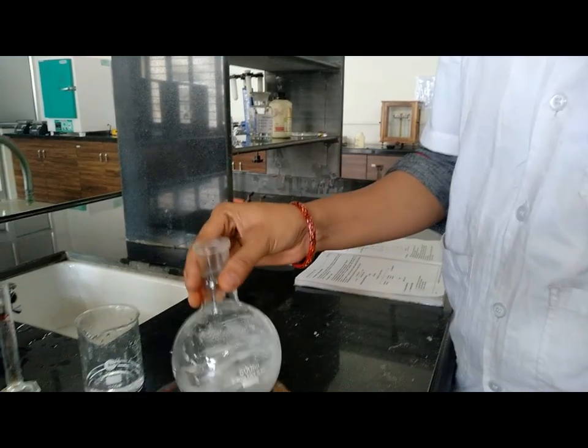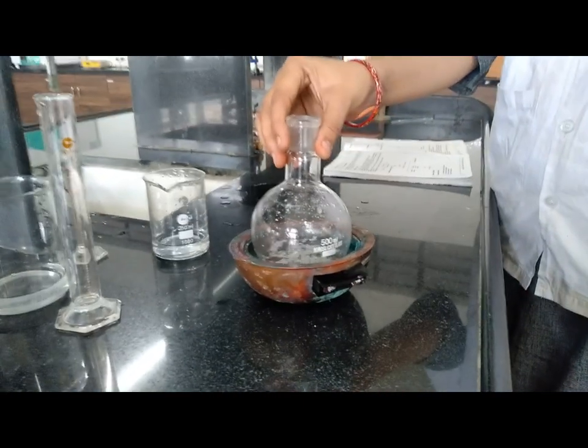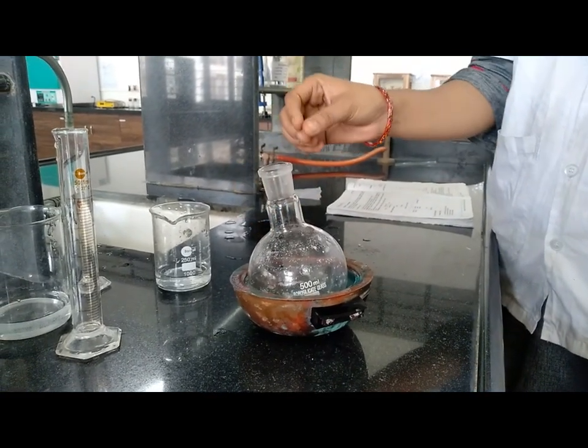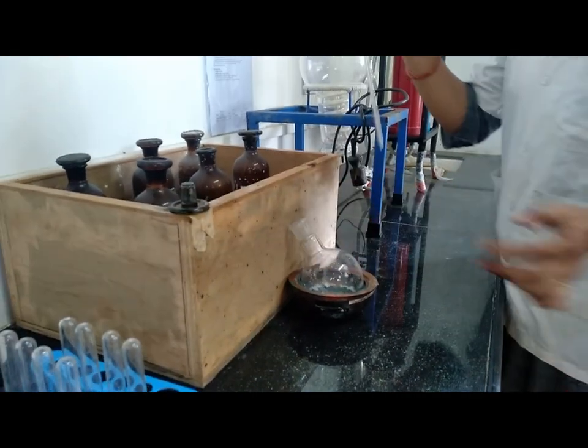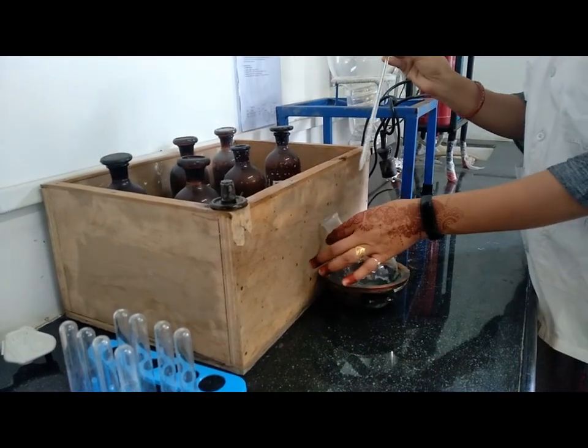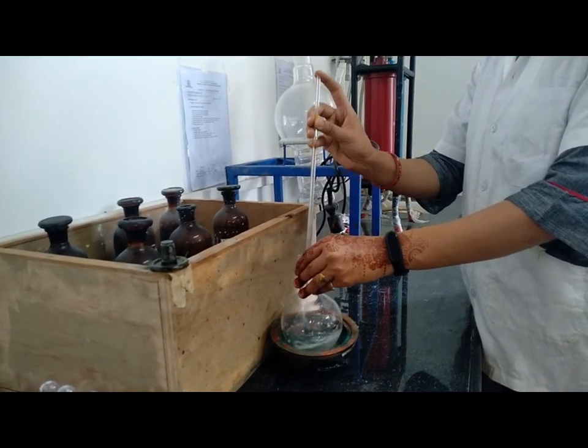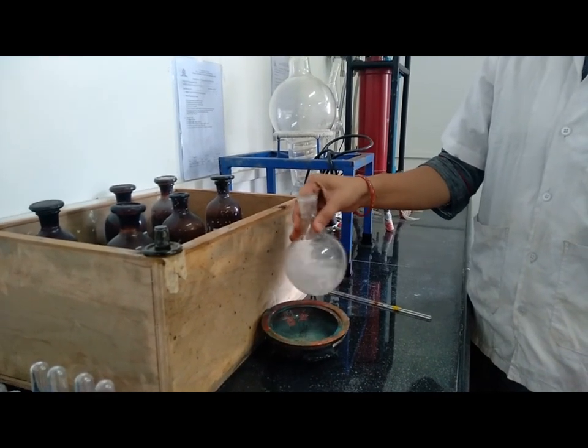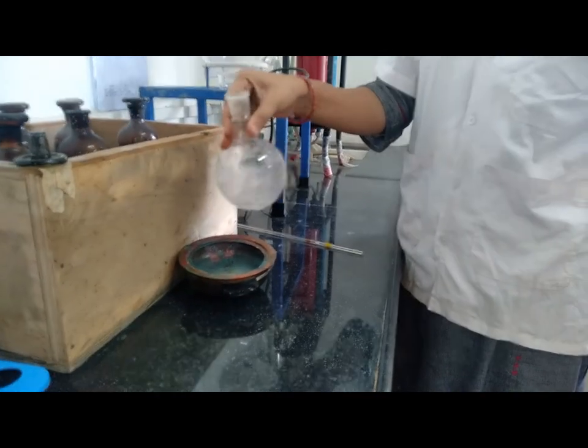Cool this solution in ice cold water for 30 minutes. Now add concentrated hydrochloric acid until the solution becomes strongly acidic. Shake continuously so that we get uniform, strong acidic solution.